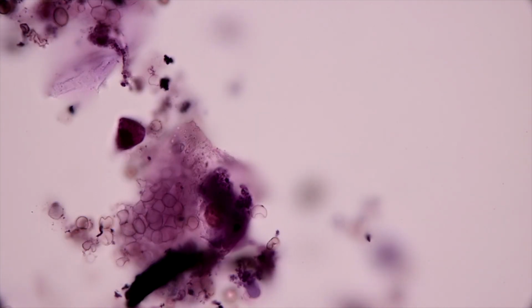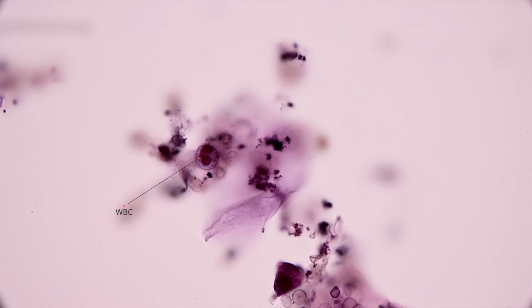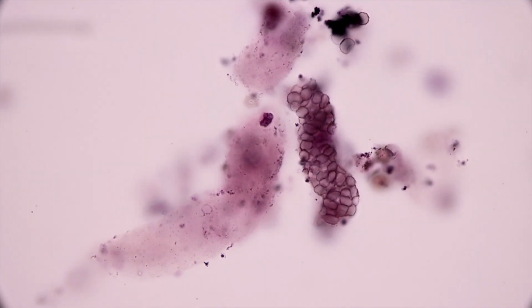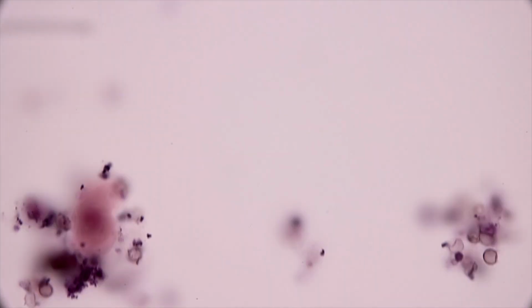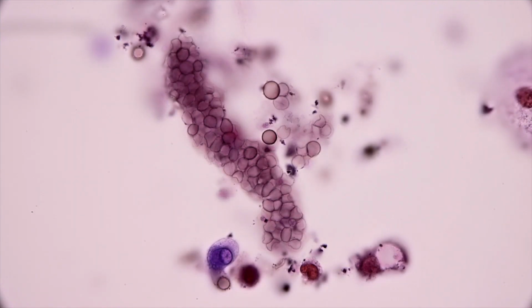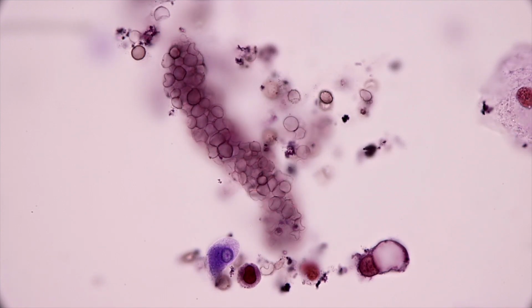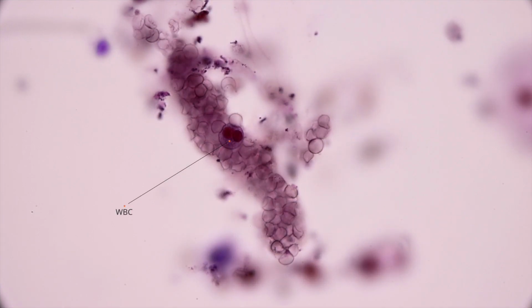Here it looks like a cell with a large eccentric nucleus, perhaps a tubular cell. There's a white blood cell labeled. We'll scan upwards a little bit more. Here we see another red blood cell cast. Focusing through this, we see the presence of a white blood cell right in the middle of this cast. You can see the segmented nucleus well here.